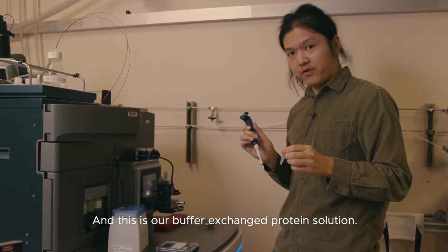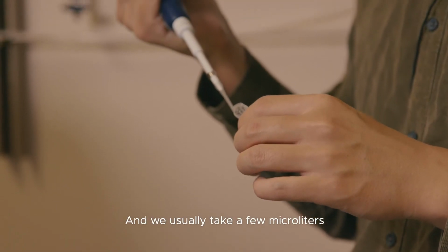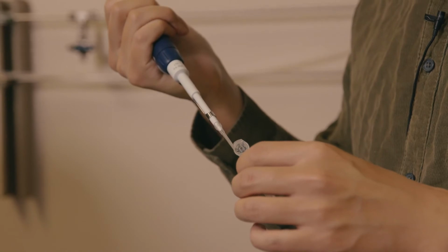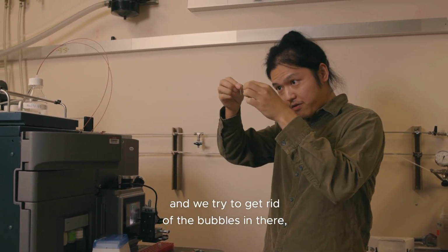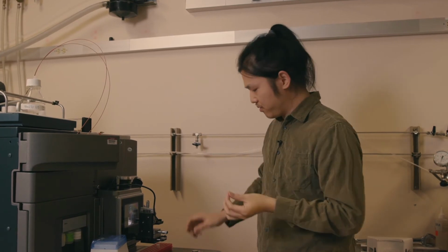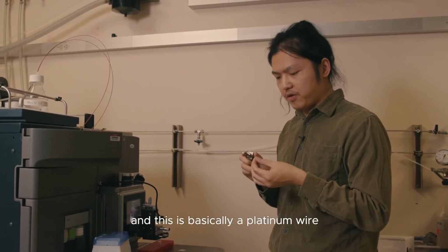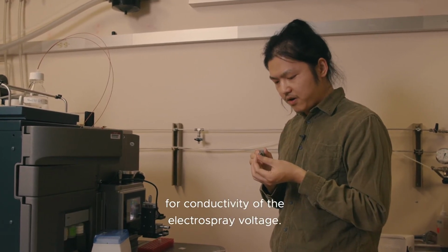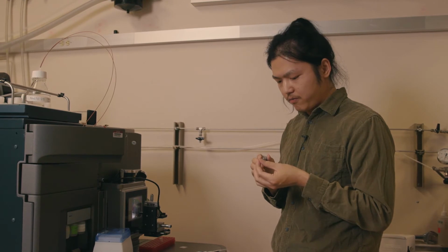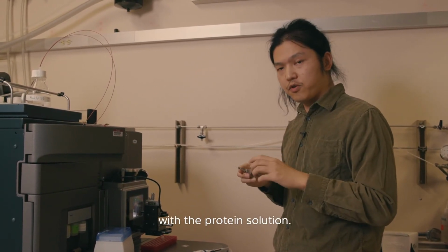And this is our buffer-exchanged protein solution. We usually take a few microliters, and we try to get rid of the bubbles in there. And then we load it onto this stage. This is basically a platinum wire for conducting the electrospray voltage, and we put it in so the wire is actually in contact with the protein solution.